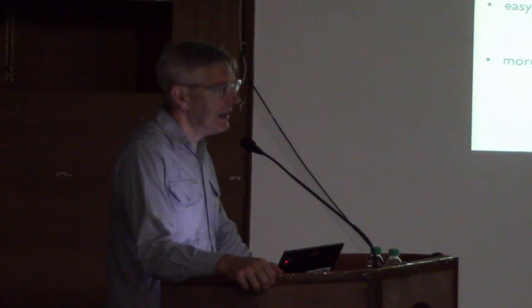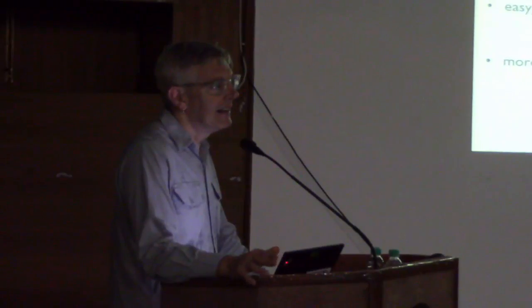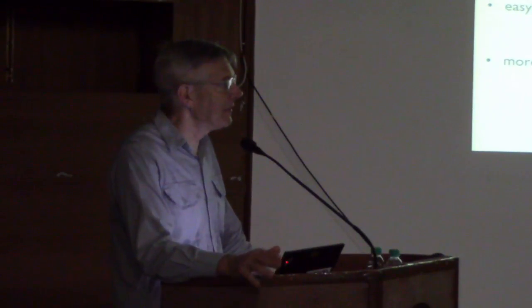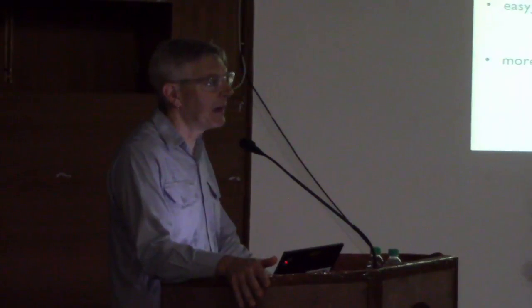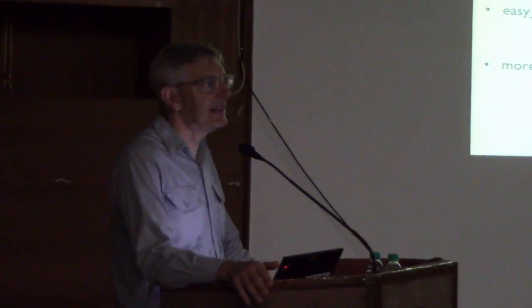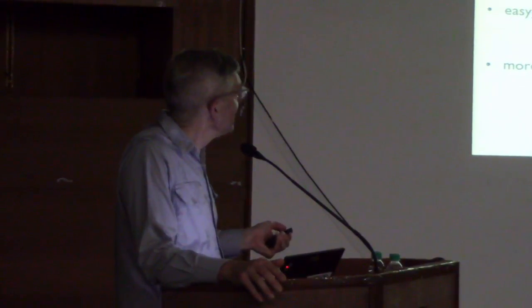PDFgui is for modeling. That assumes that you've got a PDF, you've got a gr file, and you're fitting a model to it. But the question we've been dealing with today is not how to model the PDF, but how to get the PDF from raw data. If you've done an experiment on your X-ray machine, and you have some raw data from it, and you want to get a PDF, the software that we use is PDFgetX3.